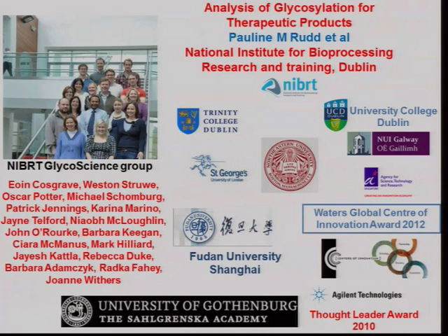So you all did a practical yesterday where you released glycans from IgG, that's right. And how far have you got? Did you put the label on? Not yet. Not yet, right, so you just did the release.